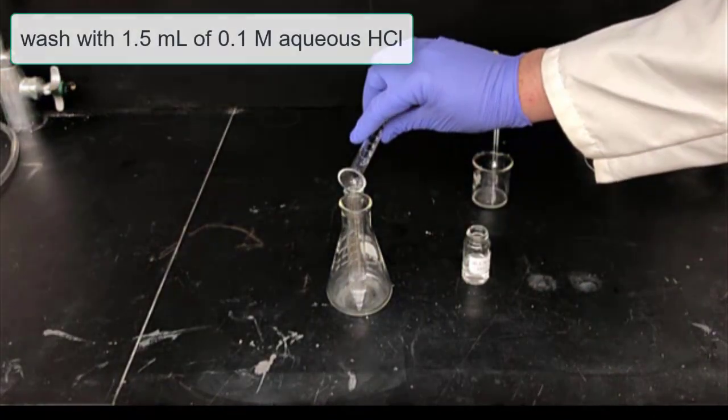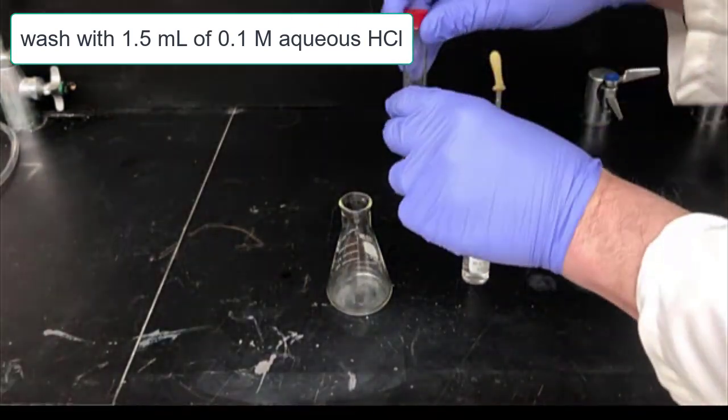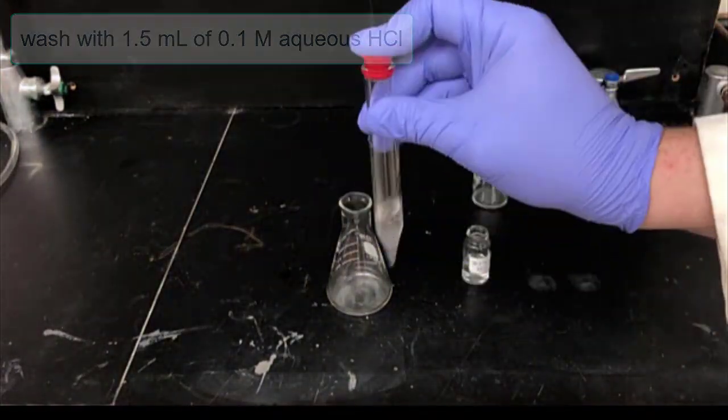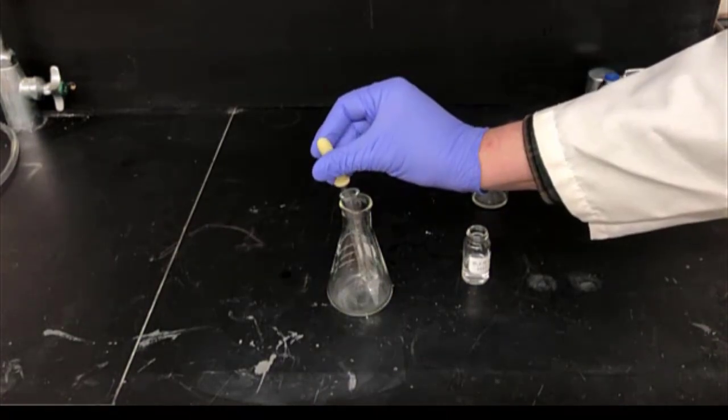Next, we'll add 1.5 milliliters of a 0.1 molar solution of HCl to the centrifuge tube and agitate it. The point of this is to remove any sodium hydroxide that might be left. Again, remove the lower aqueous layer and discard it.